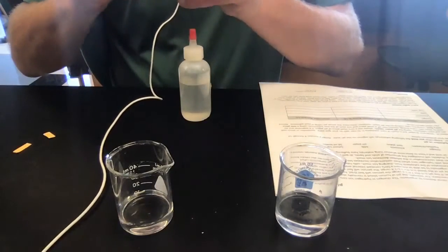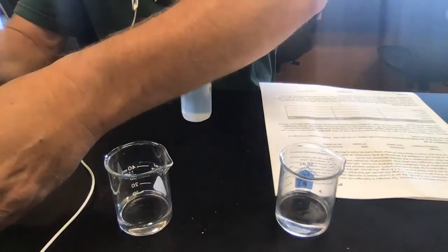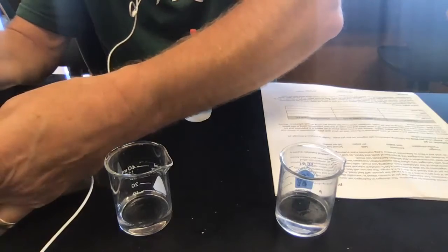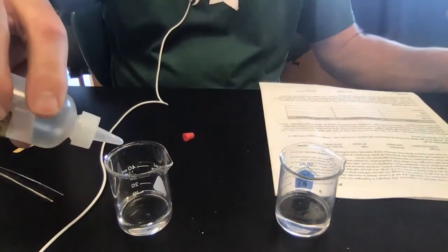I'm just trying to pull these pieces apart. And at 0 drops, we've got a pH of, it's right in between there, but this looks more like a pH of 7. So 7 with 0 drops. Then we're going to add 10 drops. These drops will come out drop by drop.